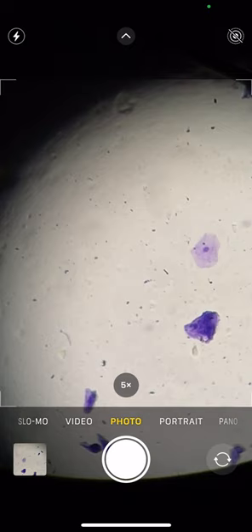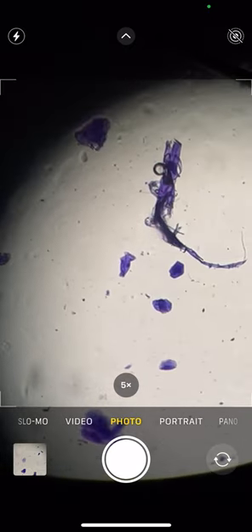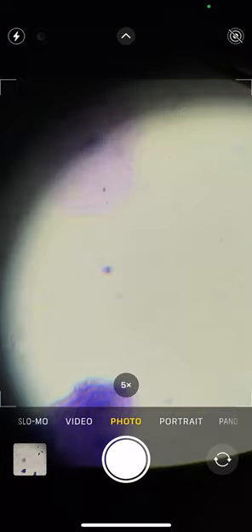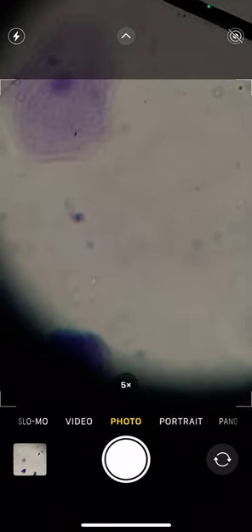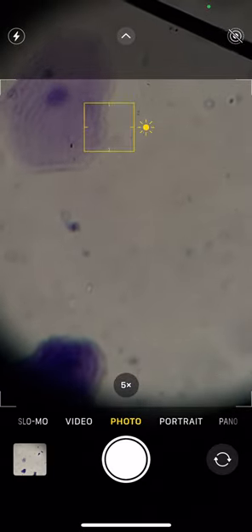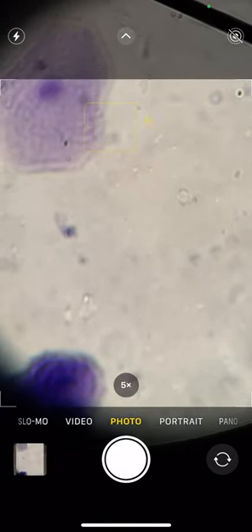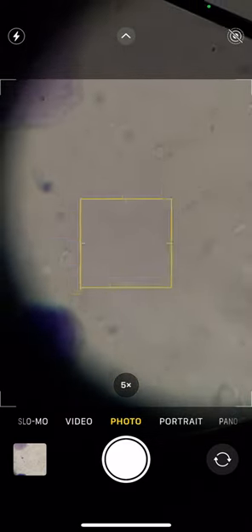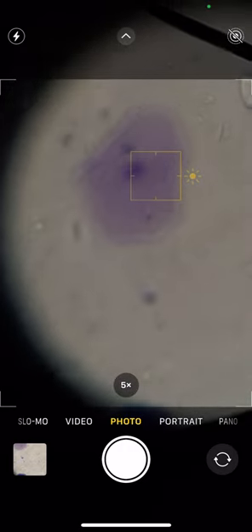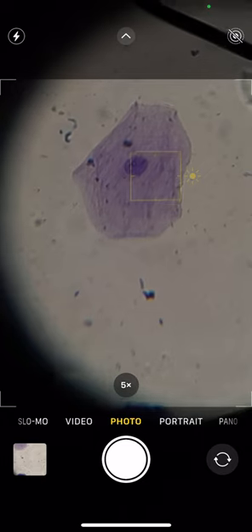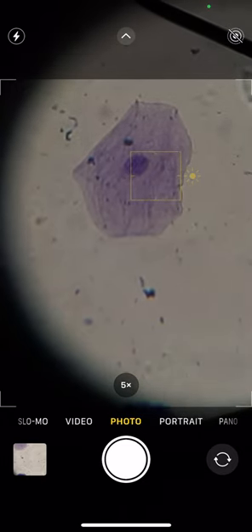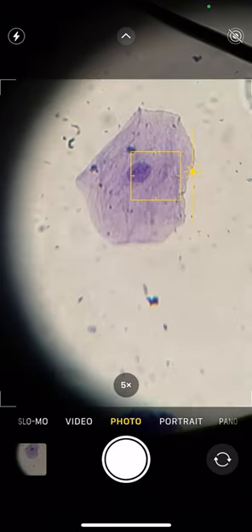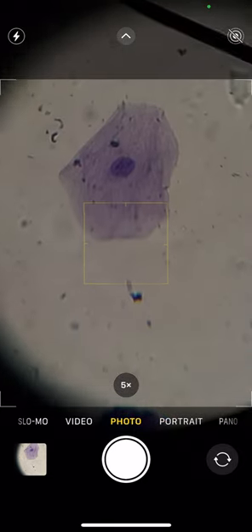Let's try this again. Oh, so close, so close. At least take that as a backup picture. There you are beautiful, that is a good looking cell, yes it is. All right, so we got it.